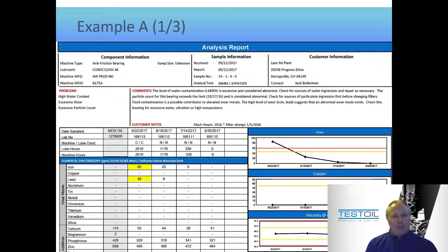And again, I get a lot of people who might suggest, well, change the oil, right? You know what's wrong, so change the oil. And I would repeat that argument that it would take 4 samples before we know if we actually fixed it. I said, but if we leave the oil in, how many samples do we have to wait before we know we found the actual source of the problem? And most people are pretty quick to answer, only 1. So then I ask you, okay, that's good, but when is that 1 sample going to be taken?